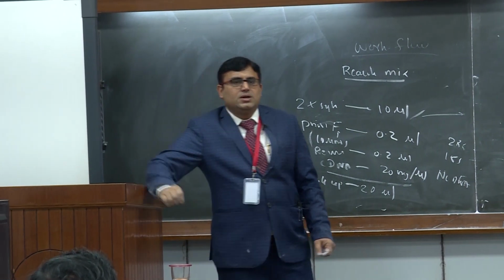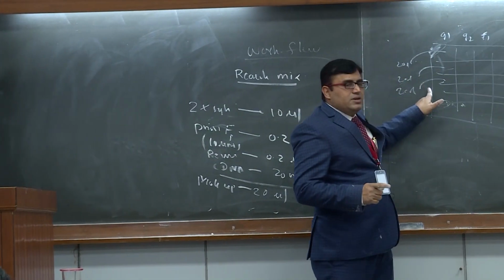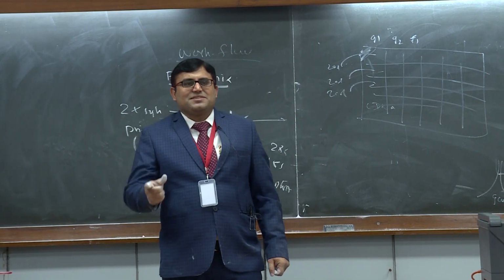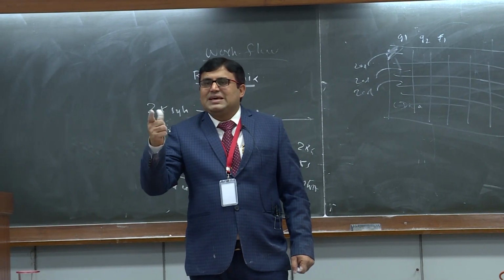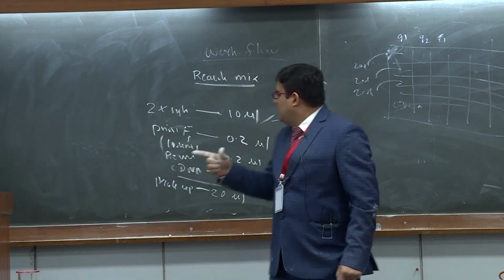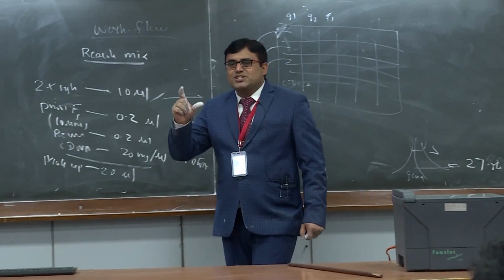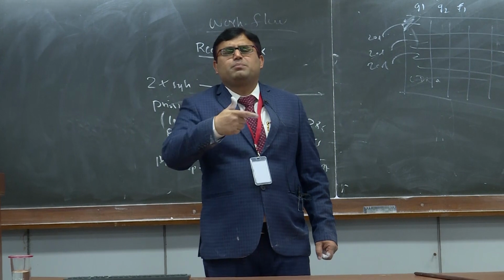Is it okay? So the check is 20, 20, 20. It should not be 55. It should be exactly 20. Because if this volume doesn't match the 20 microliter, it means the concentration doesn't match what we have written here. It means the reaction is not appropriate. It means when you feed it into the instrument, you will get abrupt CT values.